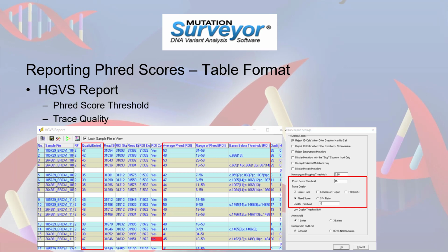Several table reports can also include Phred score information. The HGVS report can filter variant calls based on a set Phred score threshold and display trace quality information based on Phred score. When the project includes regions of interest defined in the GenBank file, this report will output additional ROI quality information such as the range of Phred scores and the location and value of the Phred scores that fall below the set threshold.